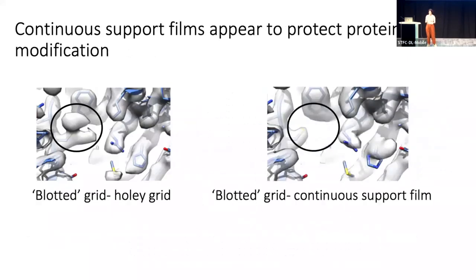So the next thing we wanted to look at was whether this is happening within the thin film environment, or whether we think this is happening at or in very close proximity to the air-water interface. So it's been well described in the field now that when you have a continuous support film, you'll get the particles absorbed onto that continuous film, and they'll be away from the air-water interface.